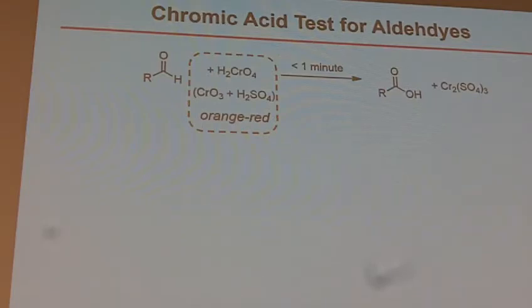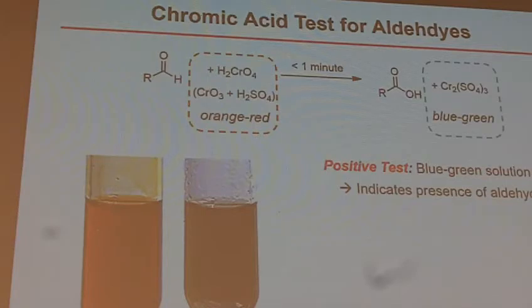So you have your aldehyde. You're going to add 1 drop of this to your aldehyde that's in a solution of acetone. And what you will get is a blue-green solution, and it actually starts precipitating out a solid. The aldehydes will react fairly quickly with this. Ketones will potentially eventually react, but they don't react right away. And so that's how you tell the difference: you see a reaction quickly with aldehydes, and if you don't get a quick reaction, then it's most likely a ketone, all right?